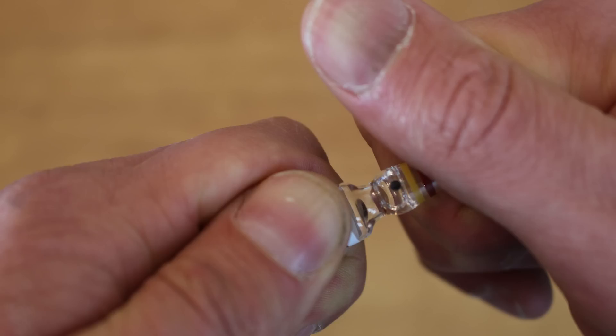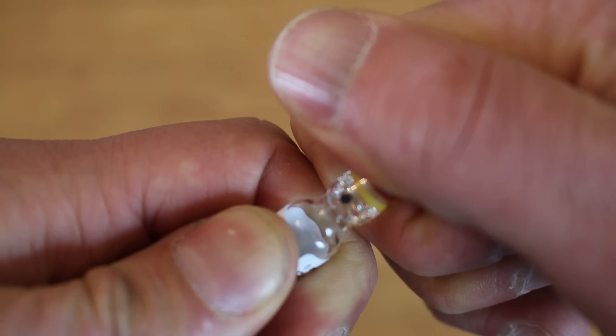If I hold the ampoule in my two hands, you can see my right hand is supporting it underneath the black dot and the left hand is holding the ampoule at the neck or the base. When it comes time to break the ampoule, you push your two index fingers closer together to make things more stable and solid — you can see the left and right index fingers are together providing support and stability underneath the ampoule on each side.